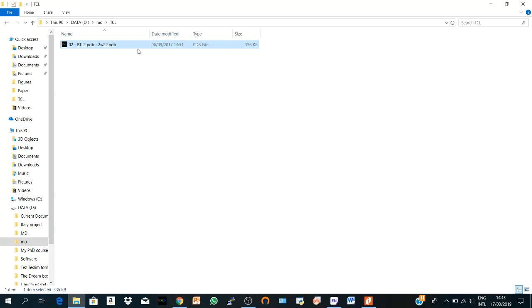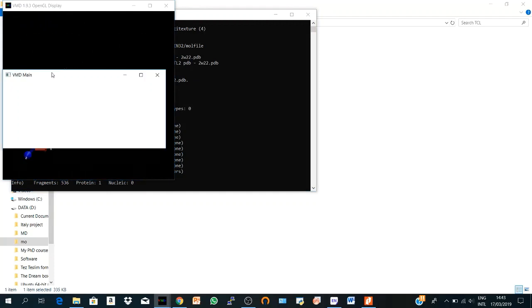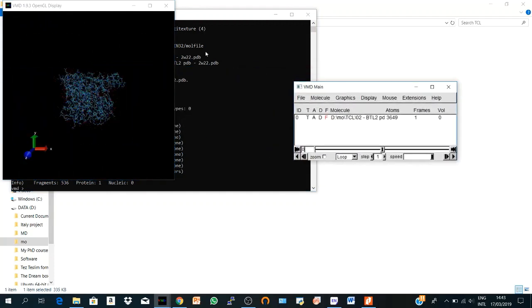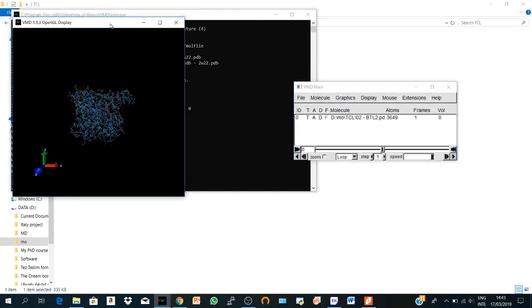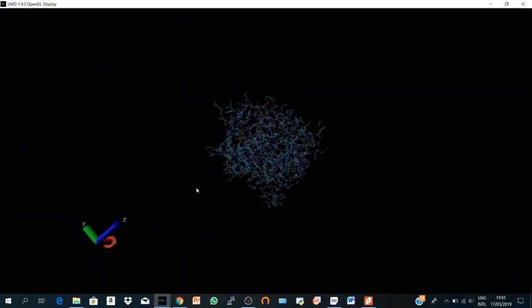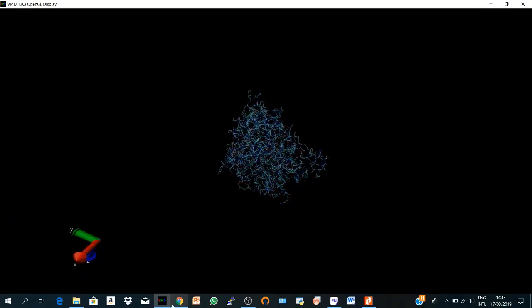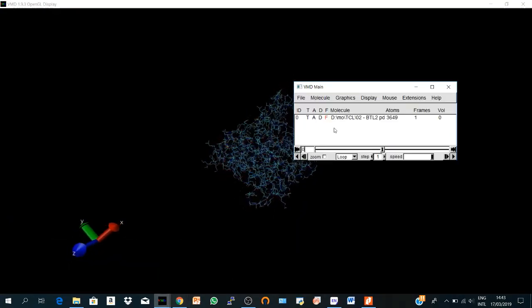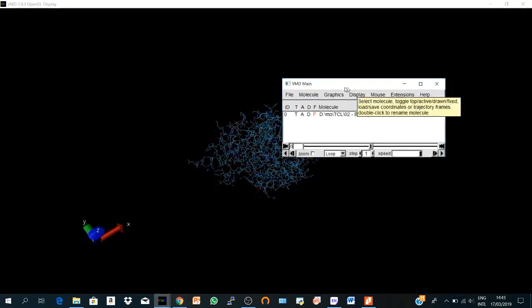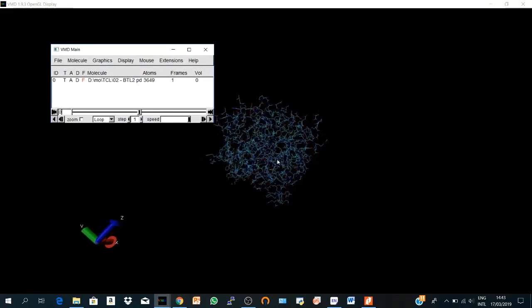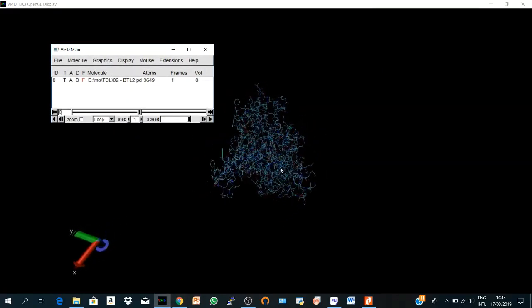So if we go to VMD, here we have it, but before we start I don't like this black screen. Some people do like it, but I prefer the white screen, so I will change it before we go to our representations.